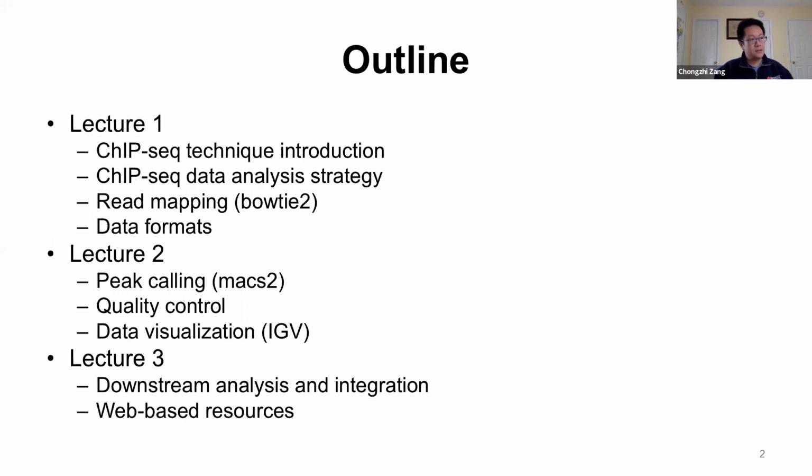If time allows, I'll also mention another ChIP-seq peak calling tool, SICER, which is focused on diffuse, like histone modification, data.